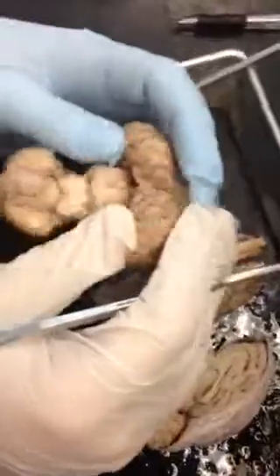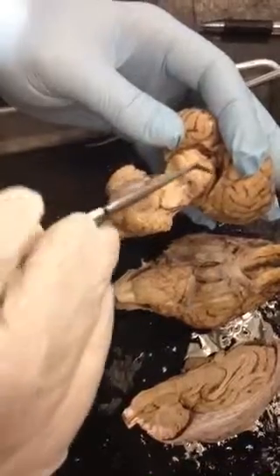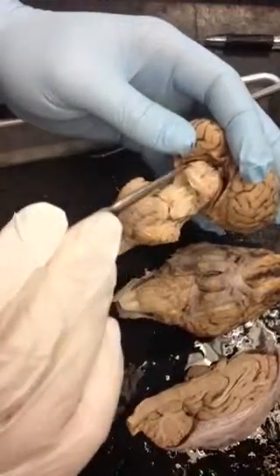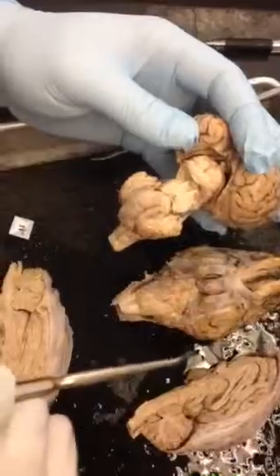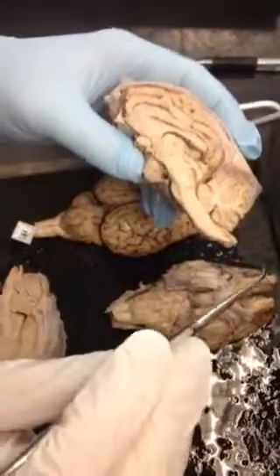If you pull this back, it's like baby buns on a bicycle seat, the analogy they use on your sheet. So this would be the baby buns bicycle seat, and on the top would be the pineal body. So this is the superior, inferior, and the pineal body is above them all right there. You can see that in the cross section too: inferior, superior, pineal body.